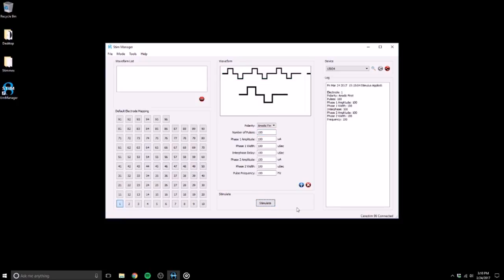This is indicated in a few places. We can see it in the log, we can see the stimulation light on the Stim, and we can see it in our analog input that is connected to the sync output of the stimulator. Remember that a sync output is high whenever the stimulator is stimulating. It will stay high during successive repeats of the same biphasic pulse, so it is mostly used to see when a stimulation began or to know when it ended, not for looking at individual pulses.